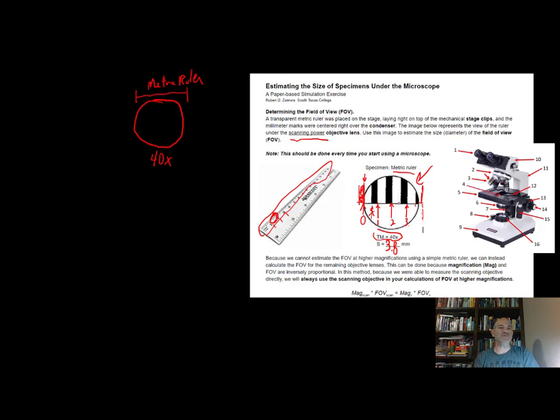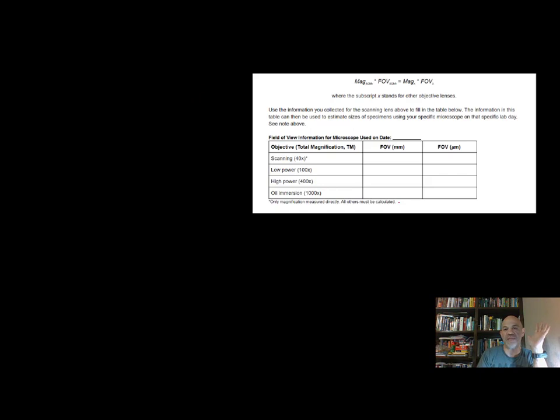So now it turns out there's a mathematical relationship between the two. So the first thing is first, you only measure the diameter of the scanning, okay? And so we determined that one to be, I think we wrote 3.8. And the top of the column says millimeters already. So you don't need to write it in the box because everything in that column is in millimeters.